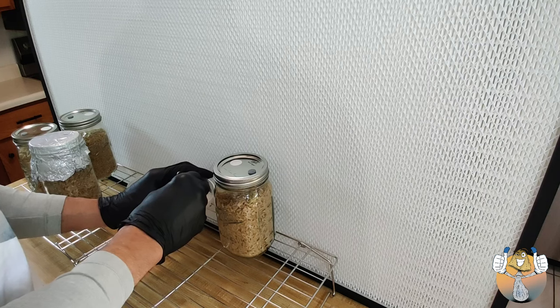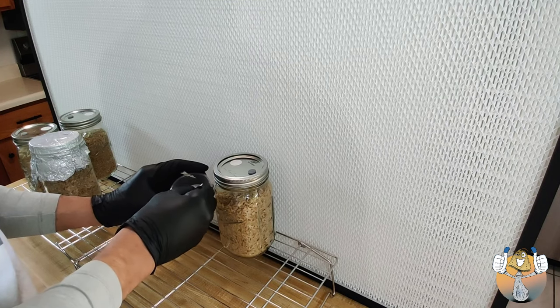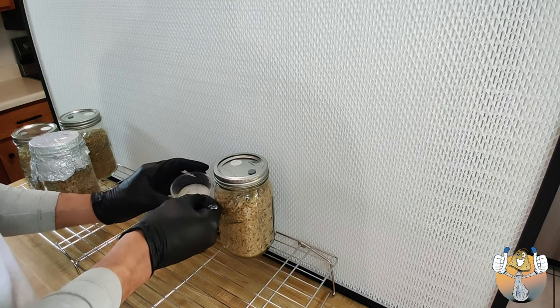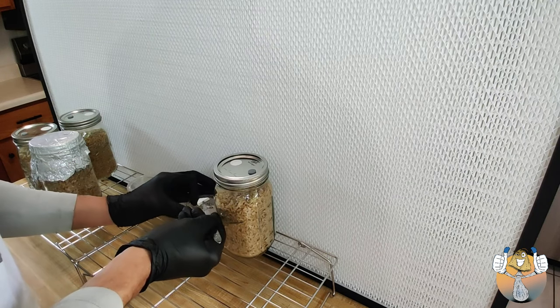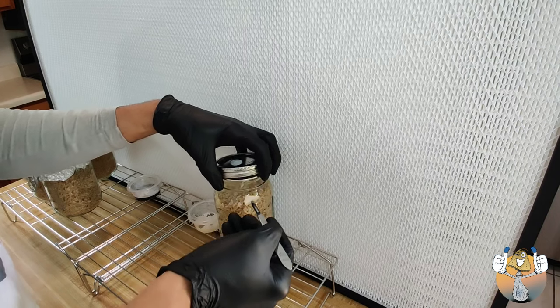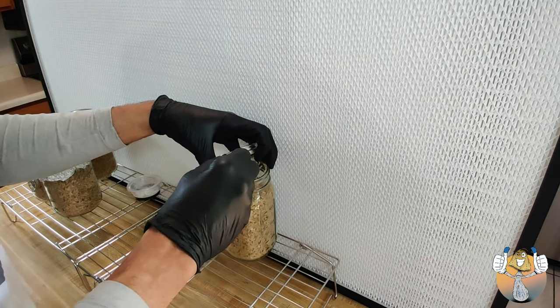Now, though my hand is blocking, I'm cutting this into small triangles. You'll see once I lift out. I'm using triangles instead of squares just to eliminate that one extra cut, just like cutting a pizza.